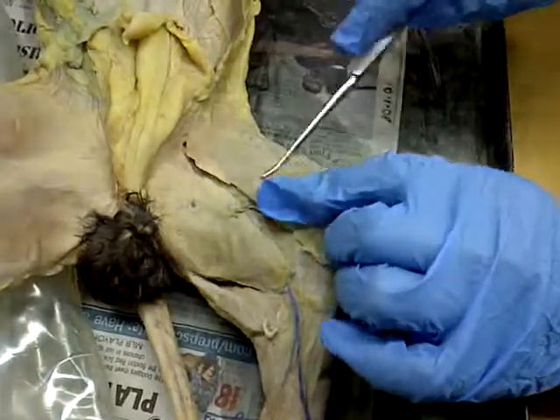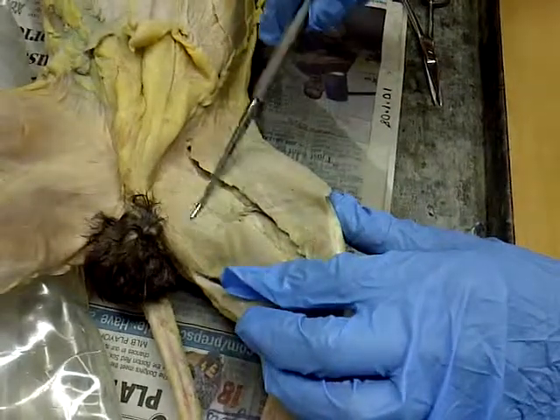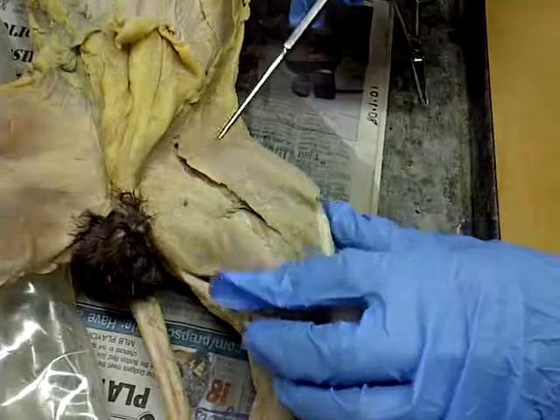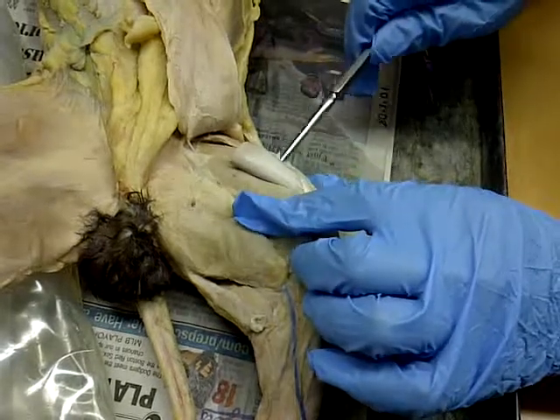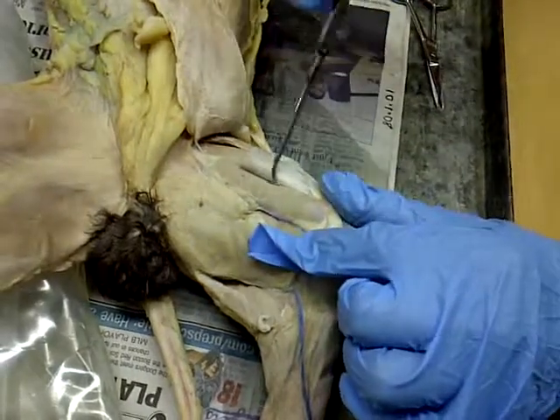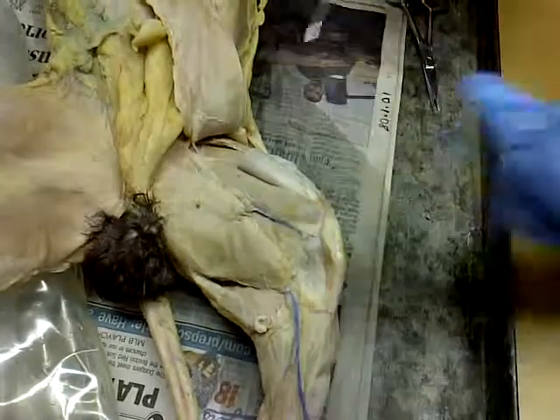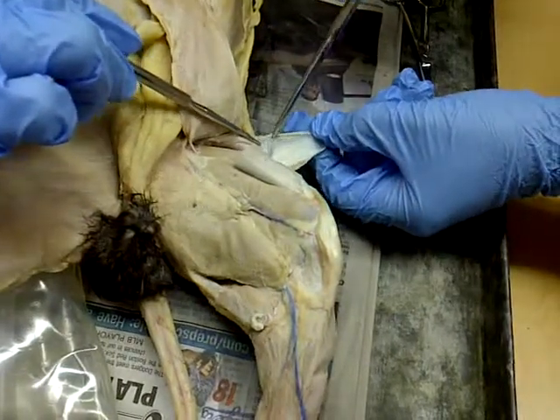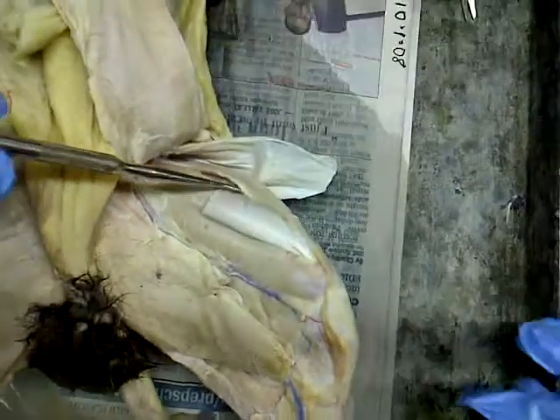Okay, so this first flap is the sartorius. This one is called the gracilis. Underneath the sartorius, we have the rectus femoris. Say that again together. On the medial side is the vastus medialis. This part is the tensor fascia latae. And then this is the vastus lateralis.